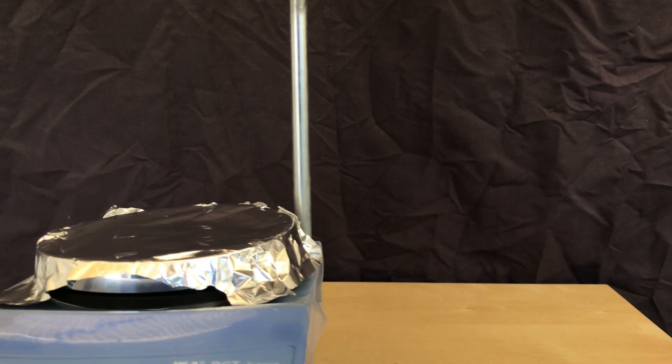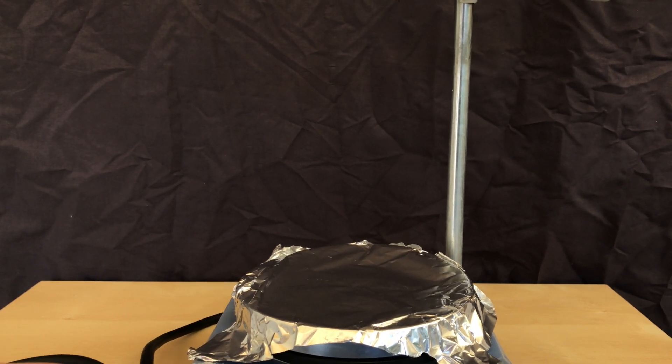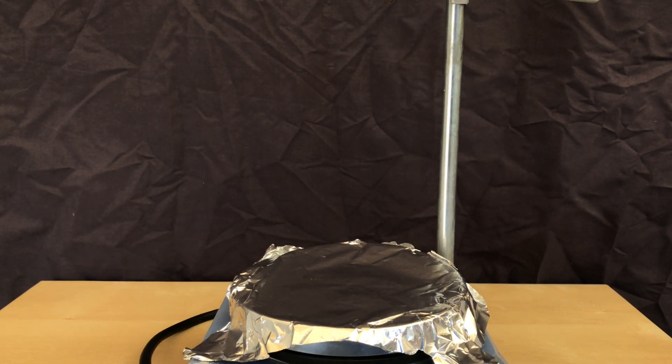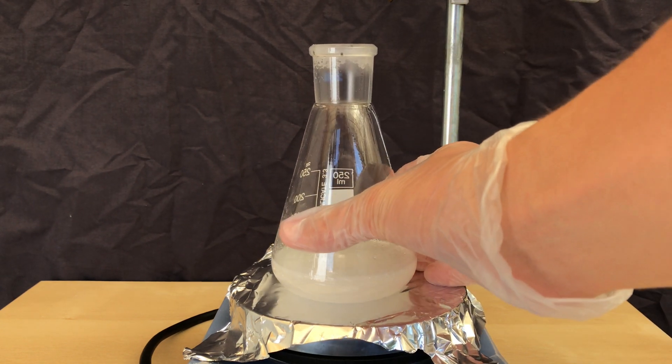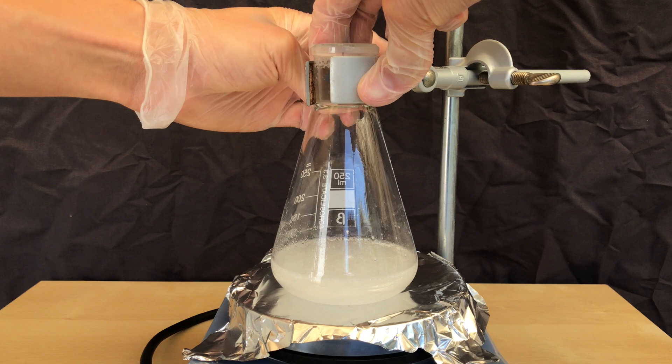The first part of the apparatus was now set up. A magnetic stir plate is used and we placed the Erlenmeyer flask on top of it. To keep it in place it was clamped down.